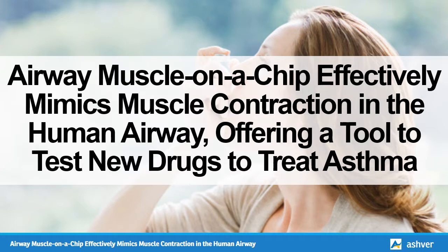You are watching an interesting video on airway muscle on a chip, which effectively mimics muscle contraction in the human airway, offering a tool to test new drugs to treat asthma.